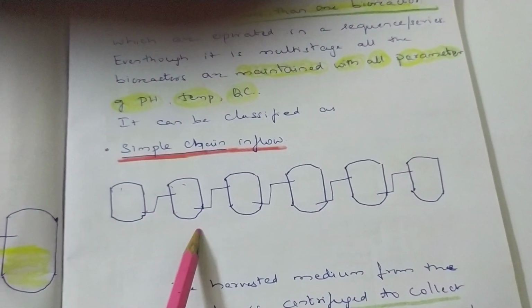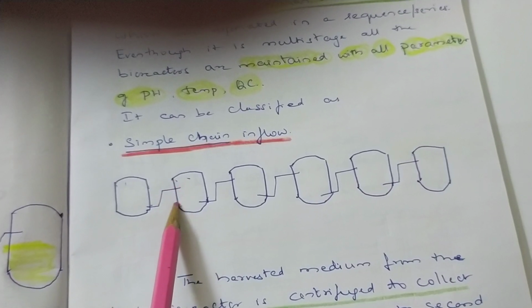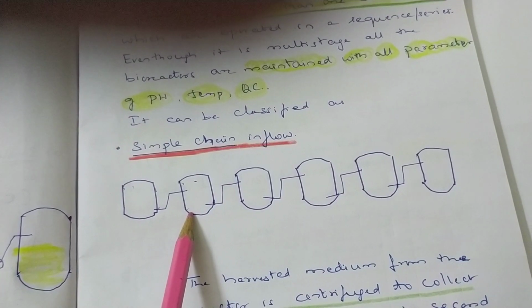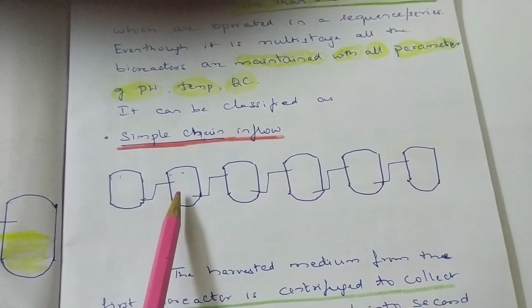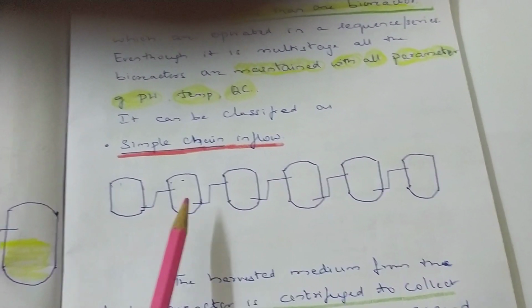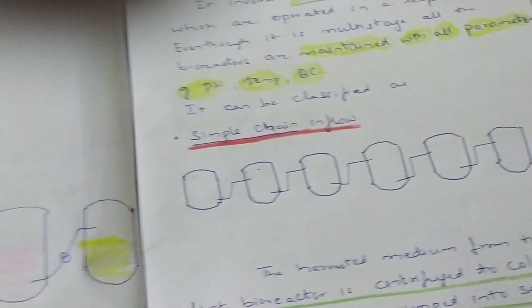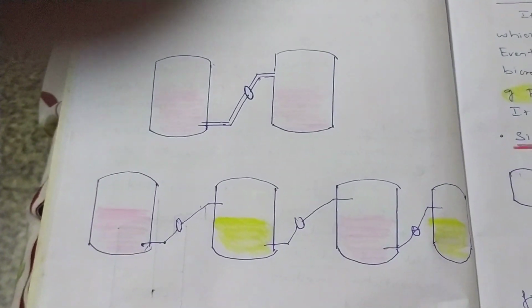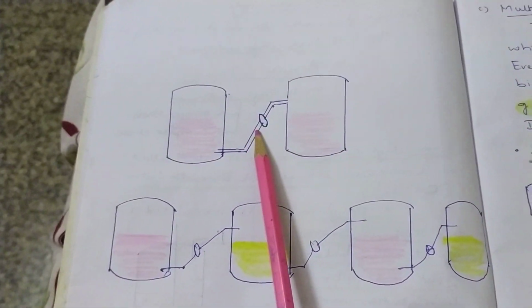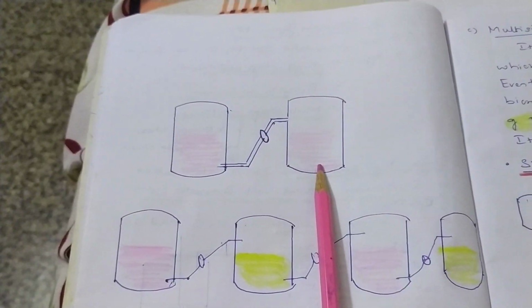So here, in this simple chain, you would pump cells from here, right? Already the cells are maybe in the logarithmic phase also. Then the growth rate will be faster. So what are we doing here? We are saving the time. That's more important in simple chain. Is saving the time enough? No. By this, you can do everyday harvesting. You need not wait like in a batch process, where you have to wait. See, in the simple chain, cells are going. This is just to understand that there is some amount of processing like centrifugation, cell density, and volume to be added like that.